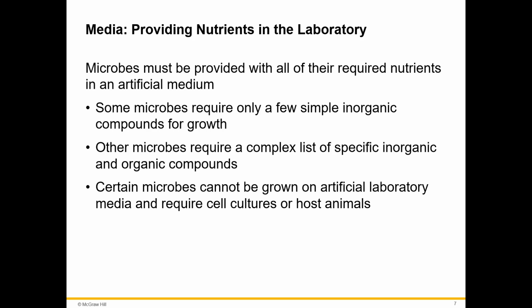Some bacteria have very specific requirements, so you have to add certain nutrients to the media in order to get them to grow. This is a constant struggle because we observe microorganisms growing on a plate and we know it can happen, but providing them the correct nutrients in order to get them to grow can be tricky. So we'll talk about the different types of media and what they're used for, but know that sometimes it's difficult to provide every microorganism everything that it would ever need in order to grow. So there are things that we can try to do to get it to grow in a laboratory.